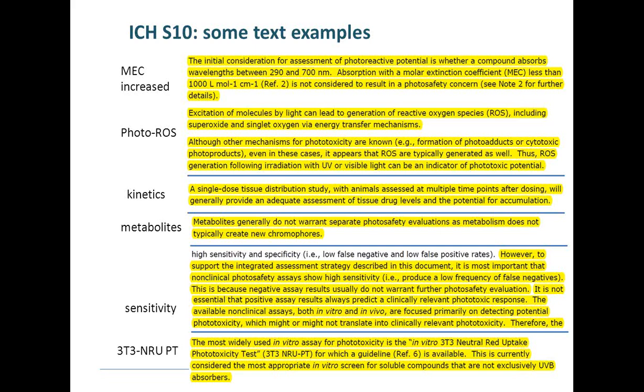That is very important, because people always say, oh, the 3T3 has no metabolic system. It is not important in phototoxicity, because that is a physical-chemical property.